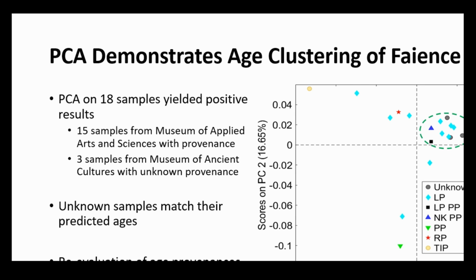I then chucked in 3 random samples from the Museum of Ancient Cultures at Macquarie University. They're from my beads from the previous slide. They came in a little box with a sticky note on them that said late period Egypt, which we can kind of throw away. That's not really documentation. That's someone's wild guess.